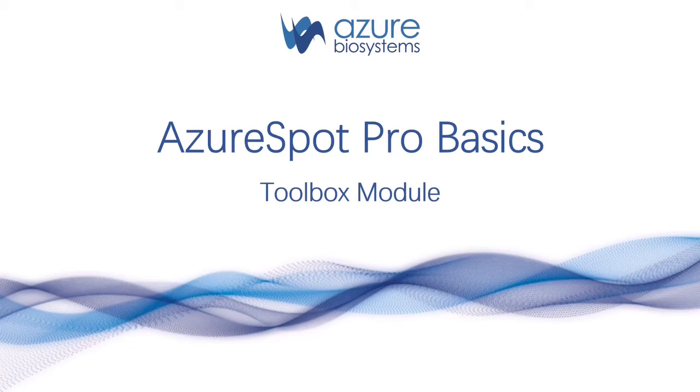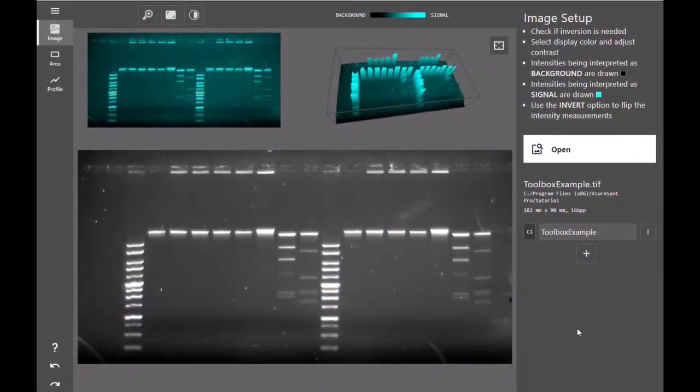This is Azure Biosystems, and today we are going to go over the Toolbox module of AzureSpot Pro. The Toolbox module of AzureSpot Pro is a great way to get some basic data out of your images or to perform quick analysis using shapes and profiles.